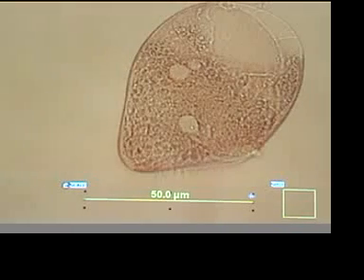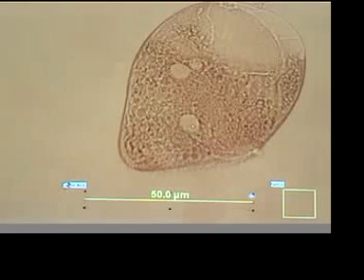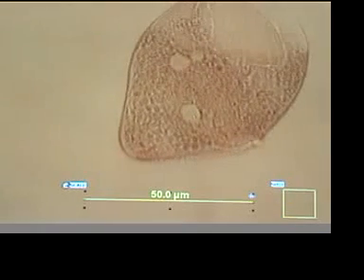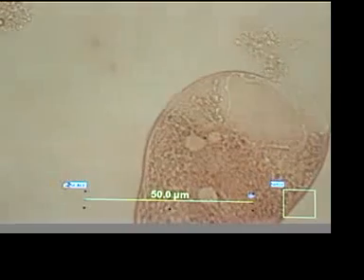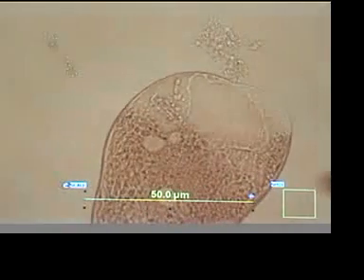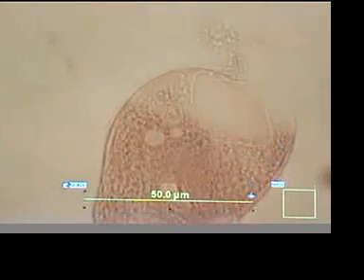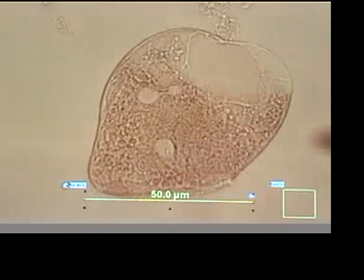Adjust the focus a little bit. That's me adjusting the microscope again. Since he's swimming upwards, I'll move the shot. I'm moving the microscope stage a little bit. Oh, there's an interesting change in shape.